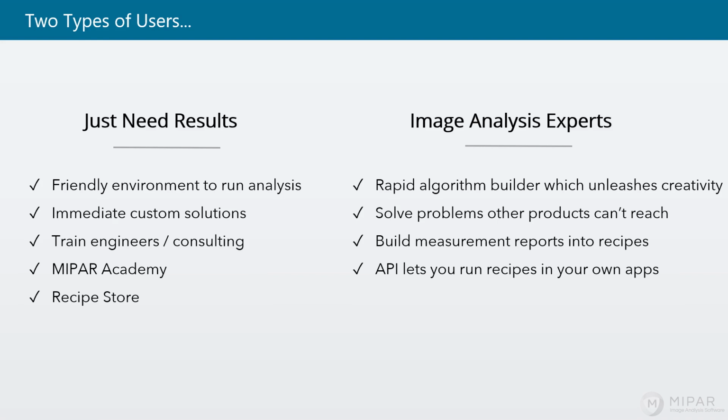We do have our recipe store available on our website that offers many pre-built solutions. These tend to be treated as learning material where you can download the recipe and example images and learn from how they're structured, with the understanding that they can easily be tweaked either by yourself or by our team to accommodate your particular problems.